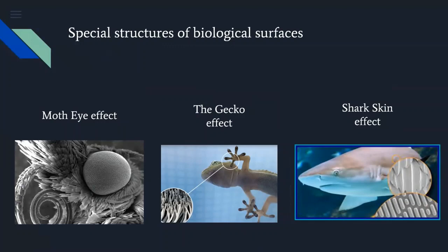Having said the possible applications of bionics in the study of these structures, it should be noted that not all examples can be studied by atomic force microscopy. This is due to a great limitation, which is that this microscopy is restricted only to materials with low roughness, so it is preferred to use traditional optical and electron microscopy. However, as we mentioned in the beginning, we are still developing such materials and the AFM is very useful to study the structure and properties of these newly synthesized materials.